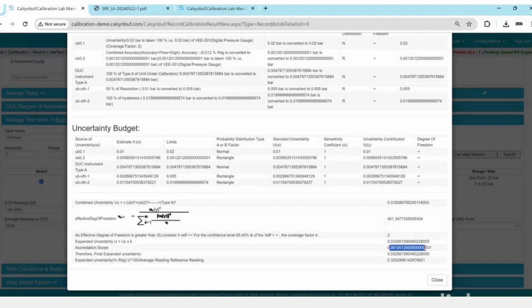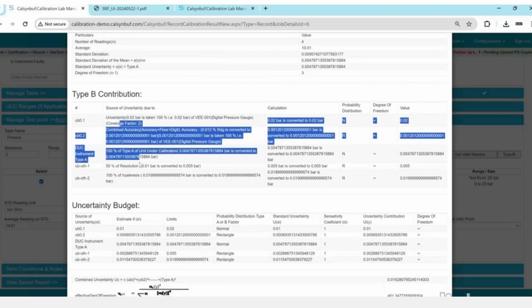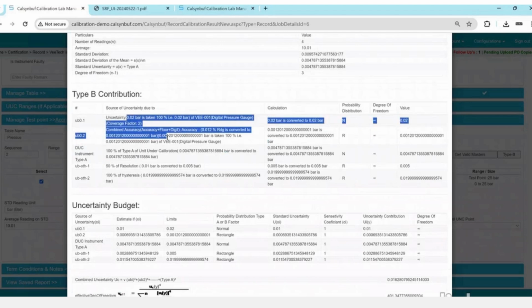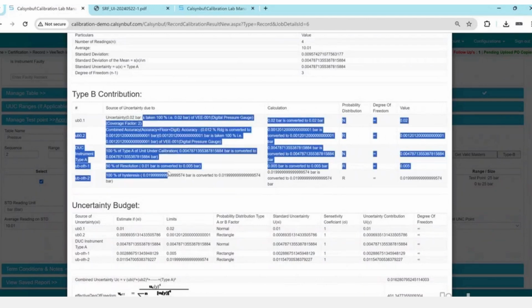If we have any changes here, we can go back to the master or any details to change it, right? Yes, in the procedure, you can change it. That's not an issue, based on these procedures, because in the procedure we have defined the uncertainty and accuracy of the standard. Type A, resolution and hysteresis, we just took. So 5 components are coming here.